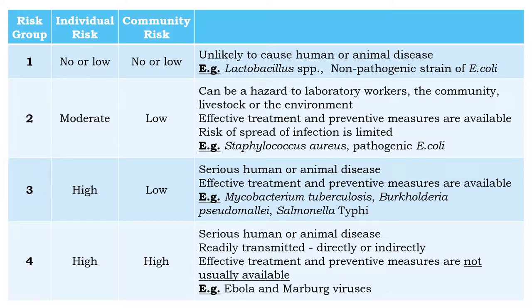Risk group 1 organisms have low or no risk to the individual handling them and the community. They are unlikely to cause human or animal disease. Examples are Lactobacillus species and non-pathogenic strains of E. coli.